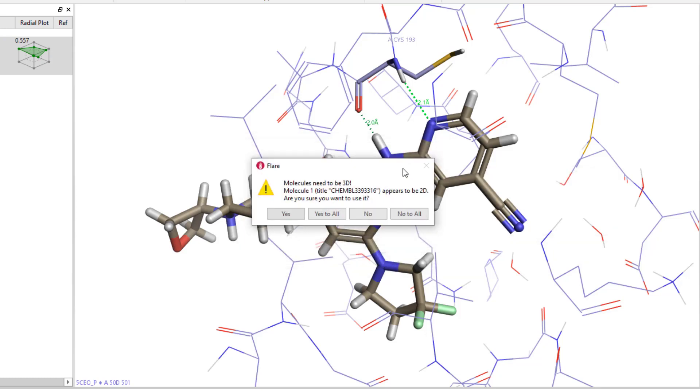I am warned that the ligands are not 3D, but this can be rectified by doing a confirmation hunt at the same time as the alignment, so I'll hit yes to all to load the ligands.